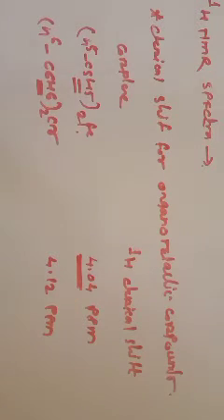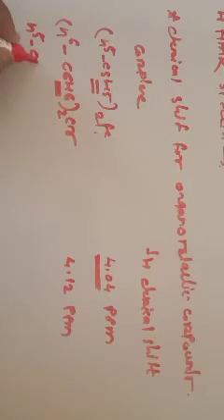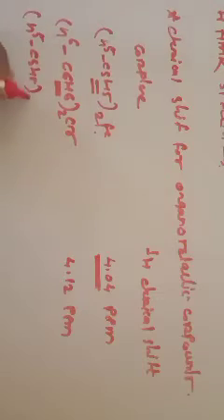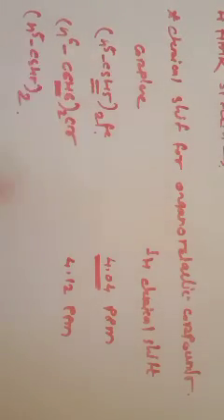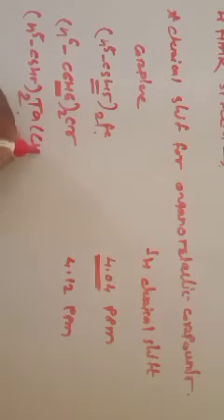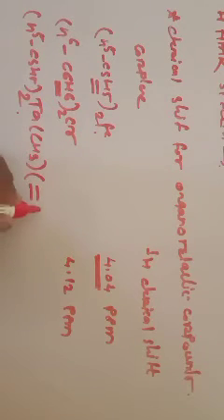One more is there, that is this complex, eta 5 C5H5 twice. Then the metal atom is tantalum, then one of the methyl groups is there, and again it is attached to a carbon carbon double bond.